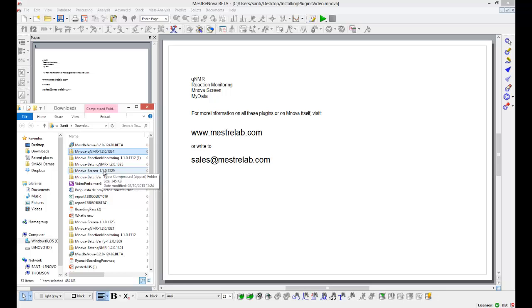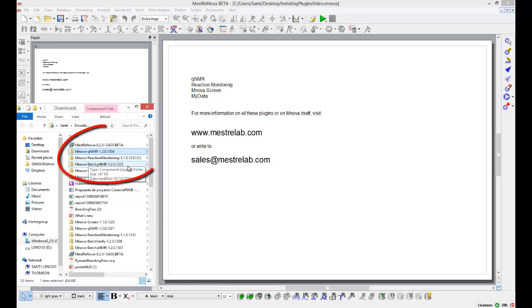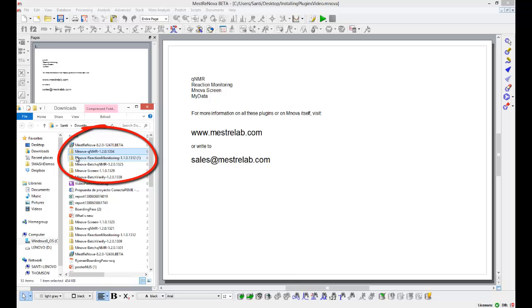This is how it works. What I have done, I have gone to the MestreNova website to the QNMR product page, I have clicked on download or try it now. This has downloaded a zip file to my download folder.